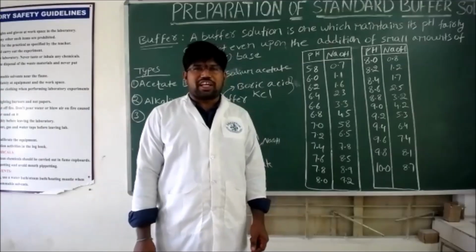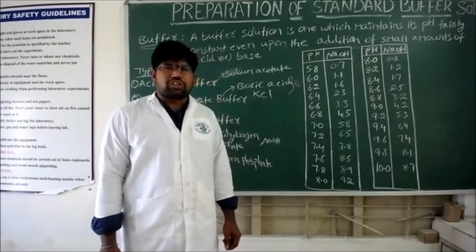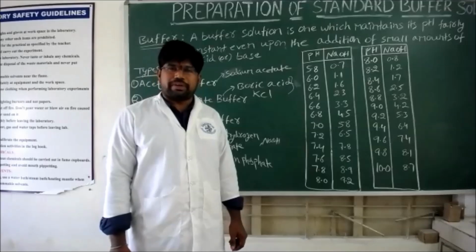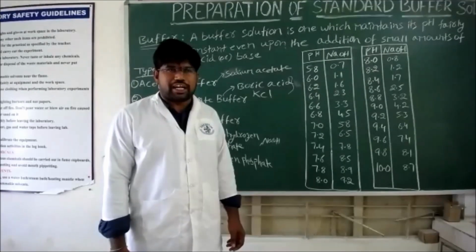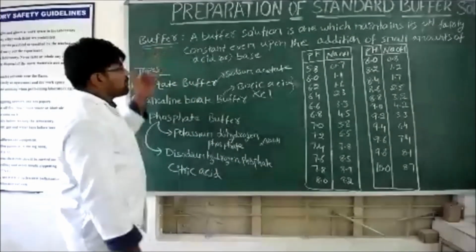So as part of our regular biochemistry practicals, today I want to discuss the preparation of standard buffer solutions and measurement of their pHs. So now I will discuss the preparation of the standard buffer solutions. So first, what is a buffer?